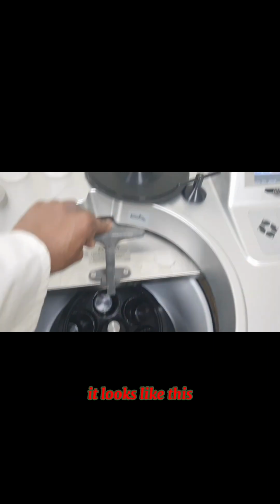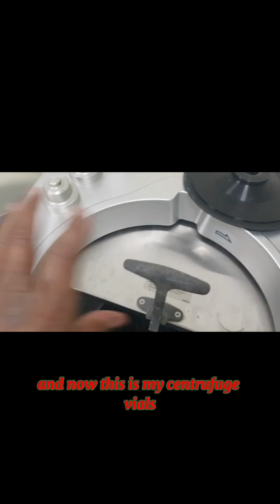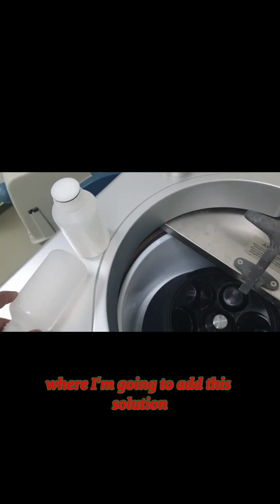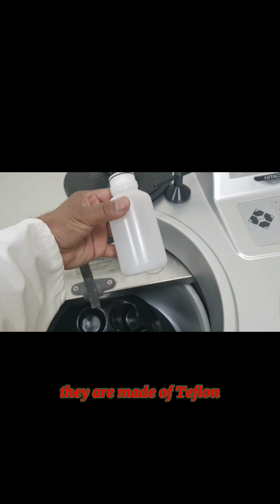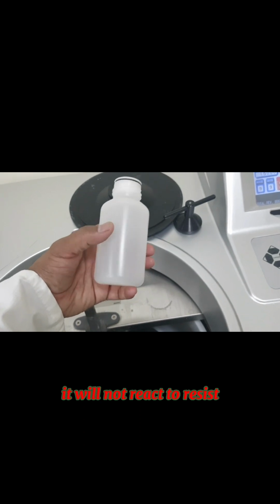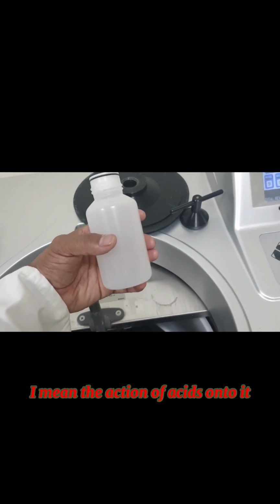It looks like this. This is my top cover here, and now these are my centrifuge vials where I am going to add the solution, and this is the top cover of the vial. They are very robust. They are made of Teflon. You can even add acid, it will not react, it resists the action of acids.